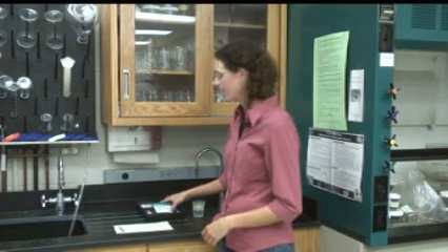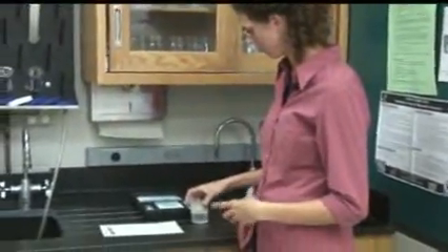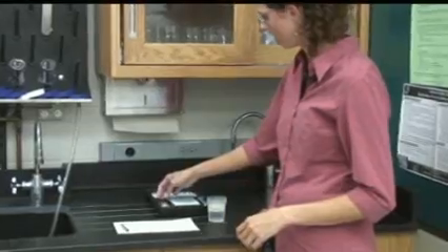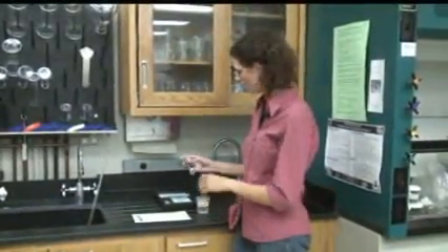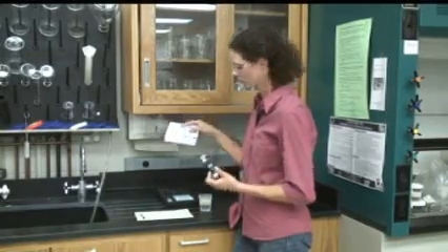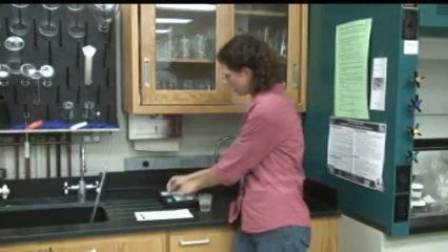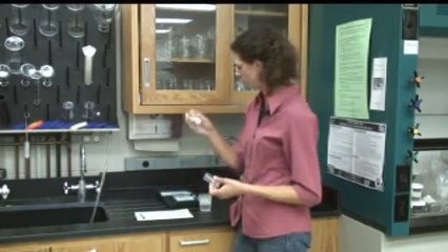In order to run the phosphorus test, we use the KMETS method, which is a glass ampoule that you mix your water in. First, check the expiration dates on your two comparators and on the bottle of activator solution.